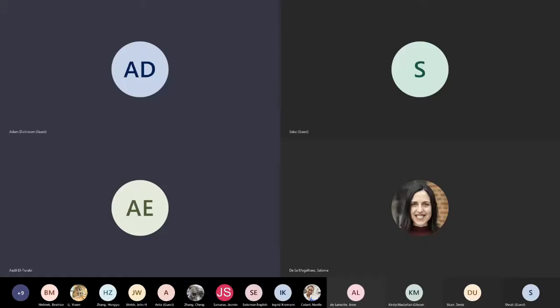The thing I worry about is that these grids are very tiny, but when you're looking through the EM, it's like navigating several football fields. So you wonder whether you're on the right pitch or in the right area. Sometimes you have a horrible grid, but there's one particular part which looks amazing, and you can get a lot of your information out of that position. If there was a way for the MiniTEM to do that, it sounds like the grid square imager is the way forward. Yes, certainly. Okay, thanks a lot.